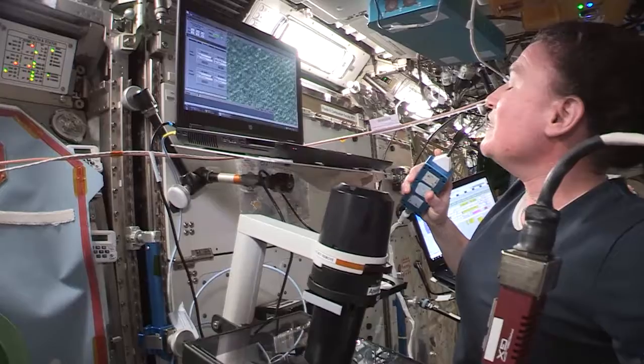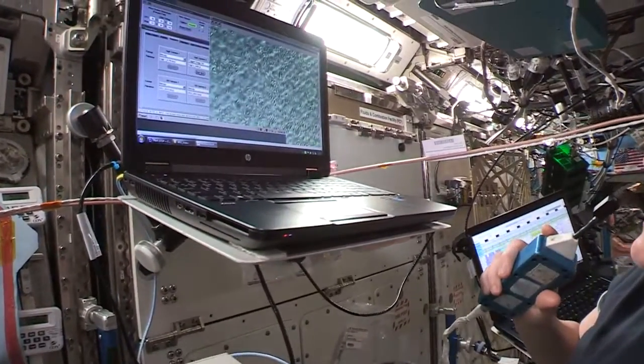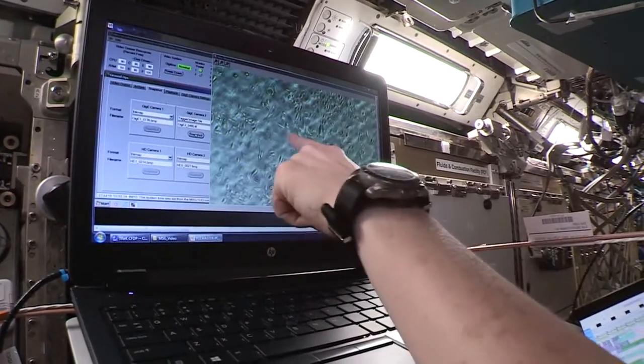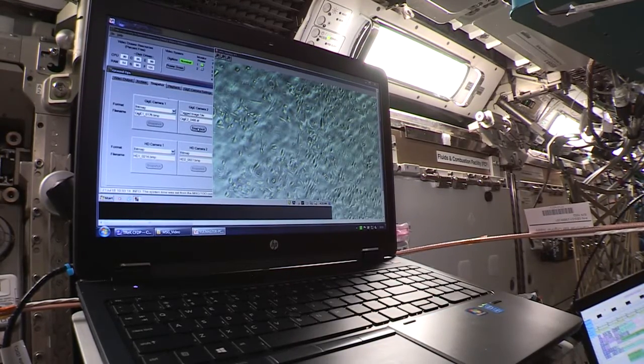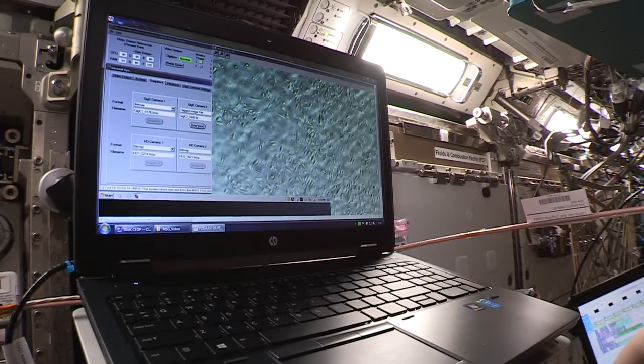Yeah, you can see some of these tubule formations here also. Good spot. Yeah, I agree, it's a good spot. You do see definitely some of the tubule formations here and some of the gaps in between the cells. Really good representation of both of those. That's a really good spot.